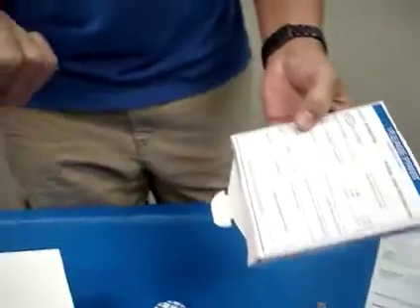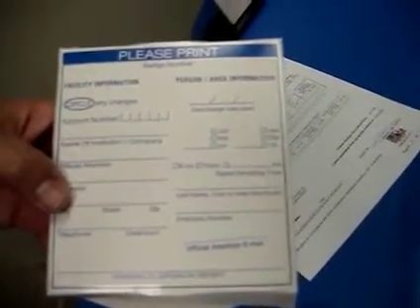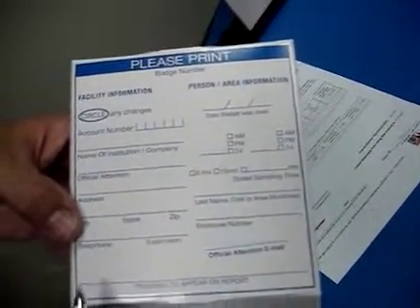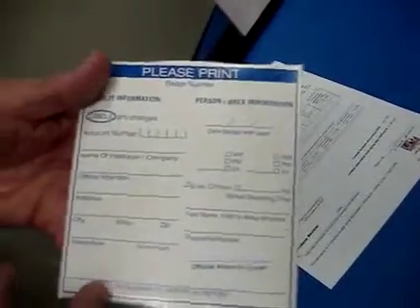On the outside of the mailer box, you're going to find an area where it says account number. If you've used the badges before, your facility was given an account number. You can just put that account number there, and you don't have to fill out the name of the institution, address, city, state, etc. If you haven't used the badges before, then you will need to include that information.